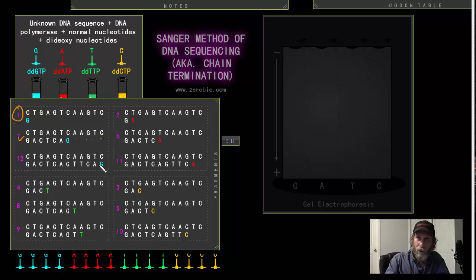That's the biggest one we could possibly have, okay? Because it doesn't really matter what happens on that end, but that's it, 12 base pairs. If we look at the dideoxyadenine analog, it could attach on the second base right here. We have a 2 base pair fragment of DNA, or it comes down right to there where I showed you before, 6 base pairs, or all the way to the end, 11 base pairs. Notice these are all different sized fragments of DNA.